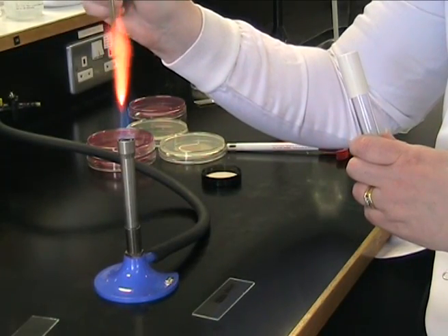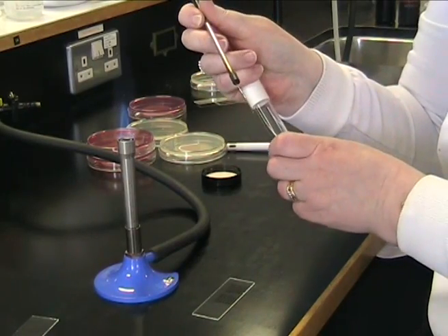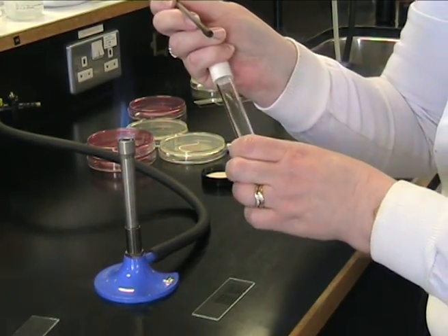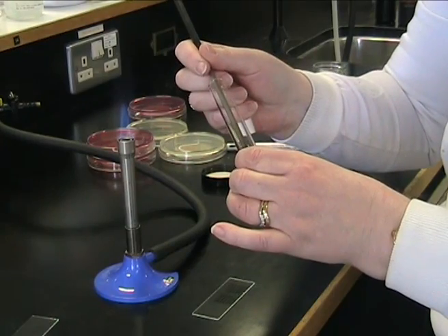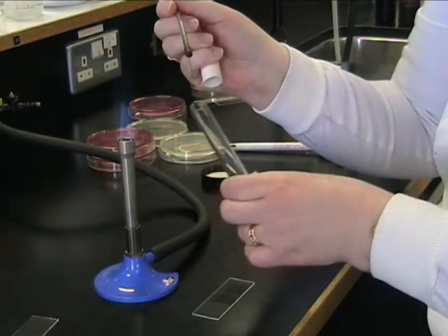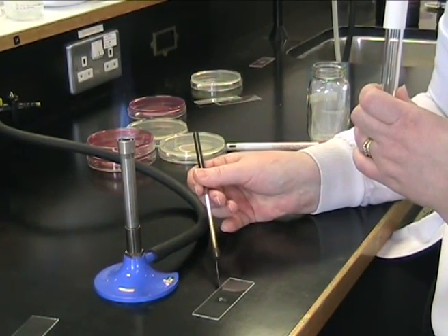Sterilise your loop as before until it's going red hot. Allow your loop to cool in the air. Using your little finger, remove the cap from the test tube. Flame the neck of the test tube, put your cold loop into the broth and take a loop full of sample. Flame the neck of the test tube again, then replace the cap, and put your drop onto a slide.